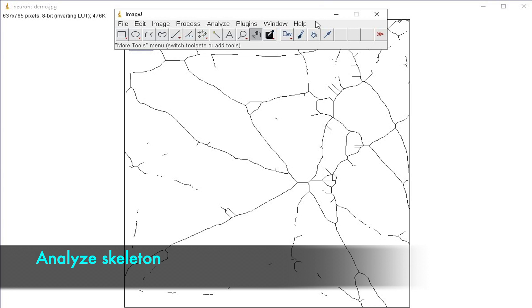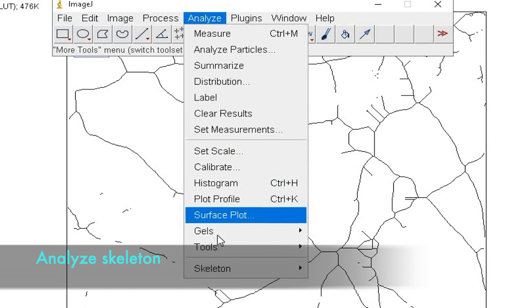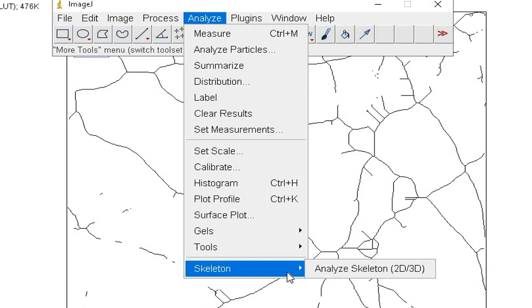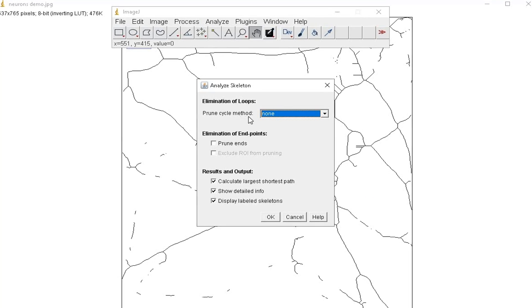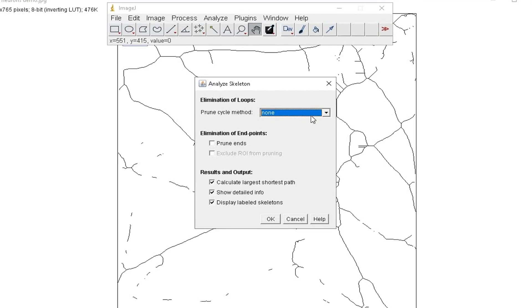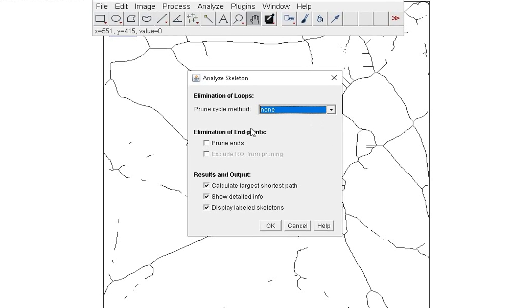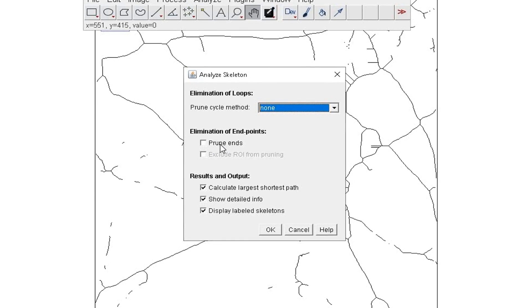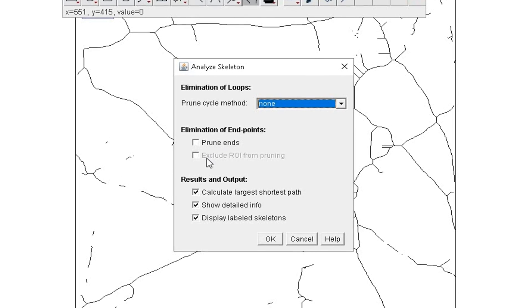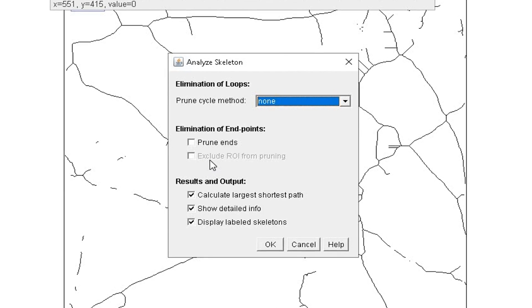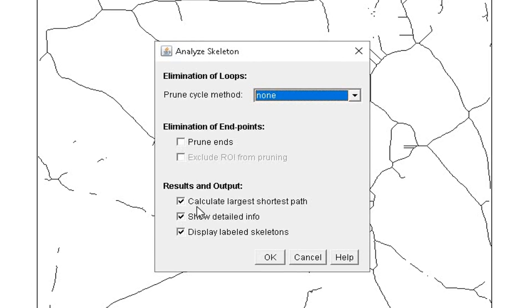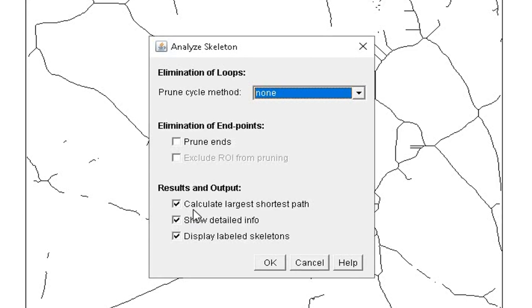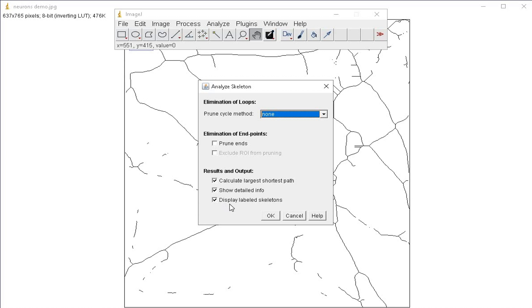Next, click on Analyze, Skeleton, and Analyze Skeleton. Keep the prune cycle method to none and uncheck prune ends and exclude ROI from pruning. However, check on the following options and then click OK.